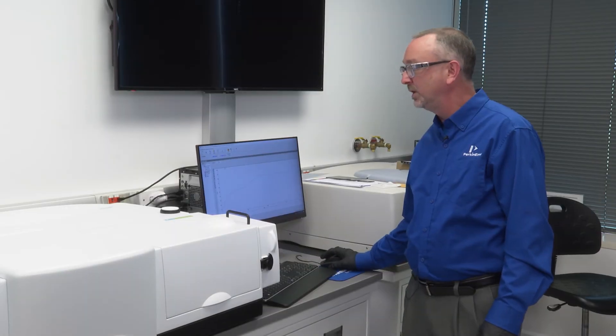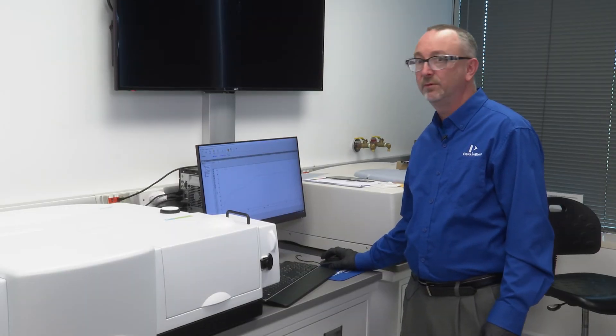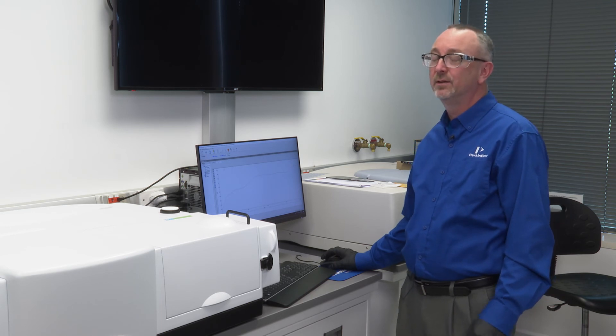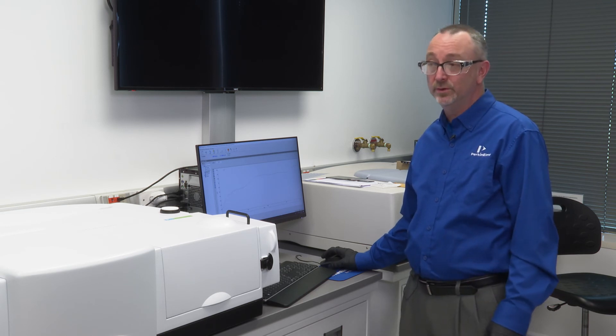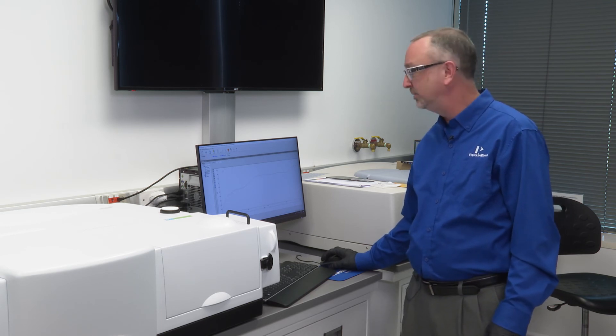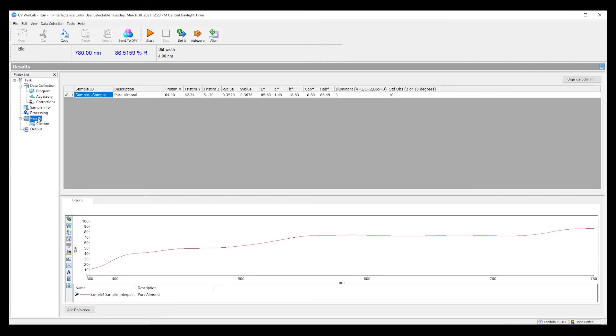Once the sample spectra has been generated, the software will automatically calculate a variety of color coordinates found in many industries. Once we've generated the spectra, we can then use the post-processing parameter section within the WinLab color software to calculate a variety of color coordinates in a variety of color coordinate systems. This includes LAB values typically found in paint, as well as chrome and hue, and also tri-stimulus values. The color software package actually contains many more versions of this analysis.